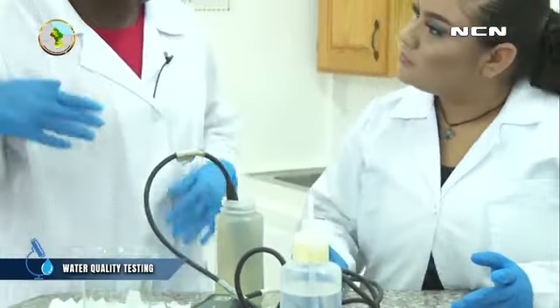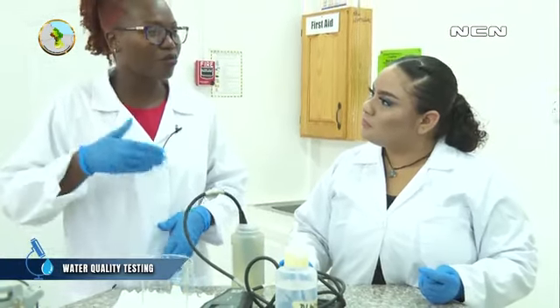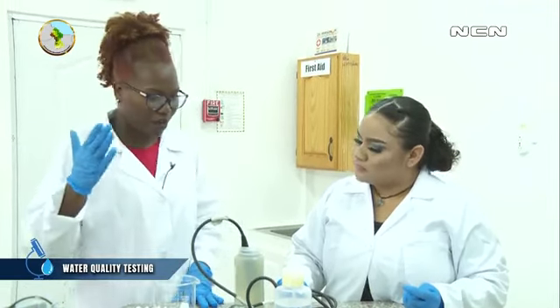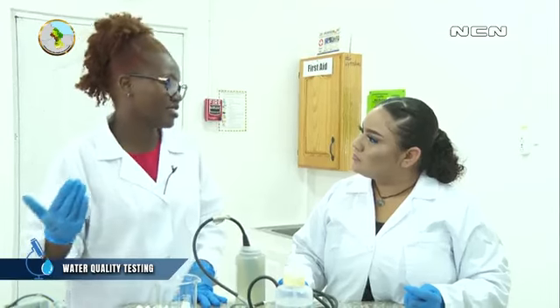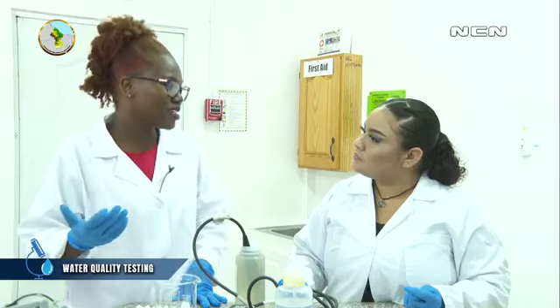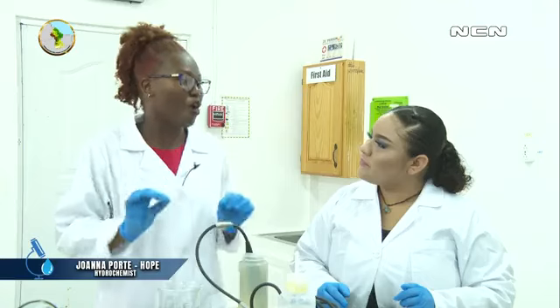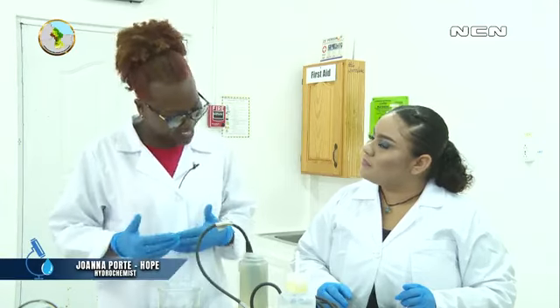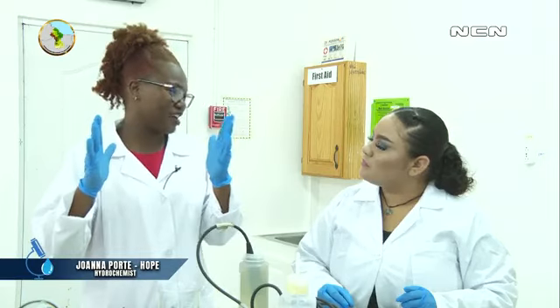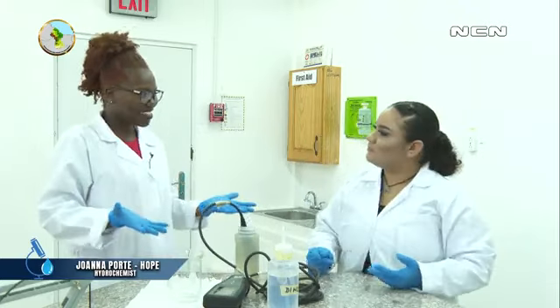For pH, the recommended level is between 6.5 and 8.5. That's telling you the acidity, or whether the sample is basic. A pH that's less than 7 means it's an acidic substance, and a pH of 8 and above means it's a basic substance. Neutral is 7, so that's perfect for us. Our drinking water should always be neutral, but the WHO has said that we can fall within the range of 6.5 and 8.5. That's fine. So it's at 8.60, and that is basic.